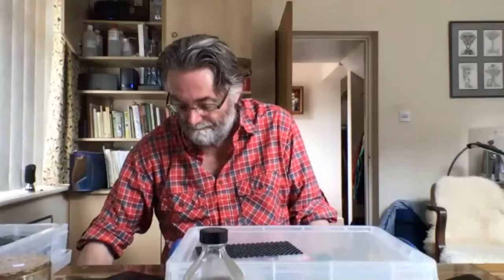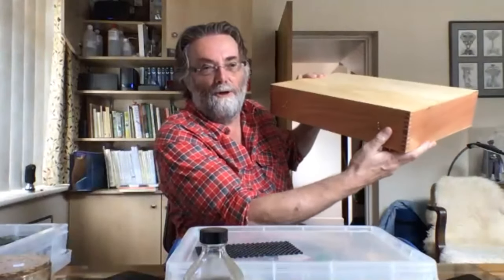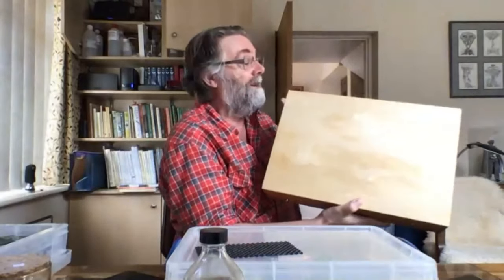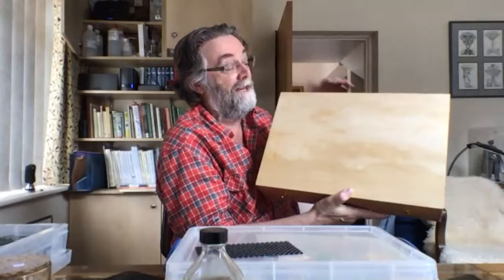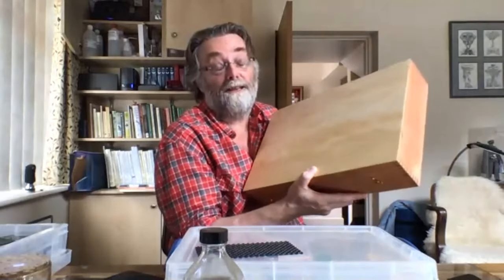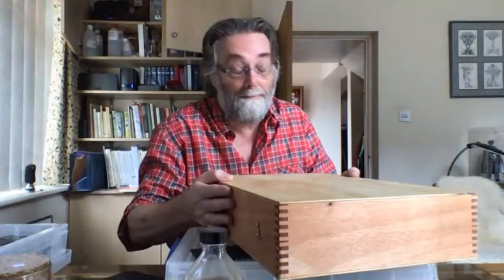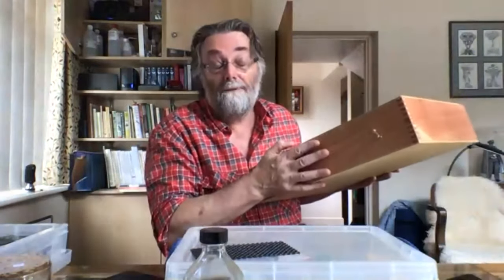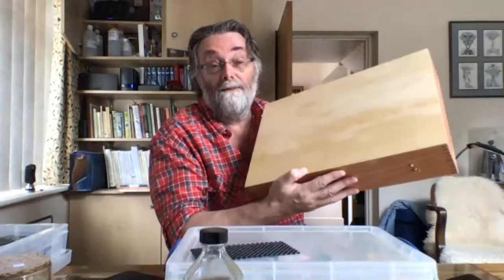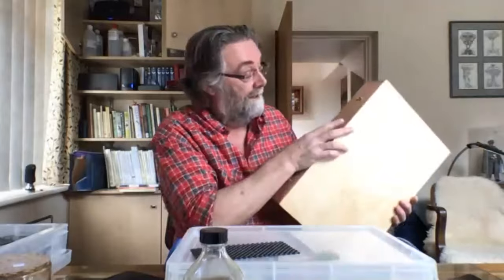The other thing worth considering is this entomological storage box — this one's empty and new. The wood is unfinished when you get them, so use linseed oil on it in the traditional way — then if you've got several they don't slip. If you have pinned specimens it gives you a really good space to pin them in. This is a big one.